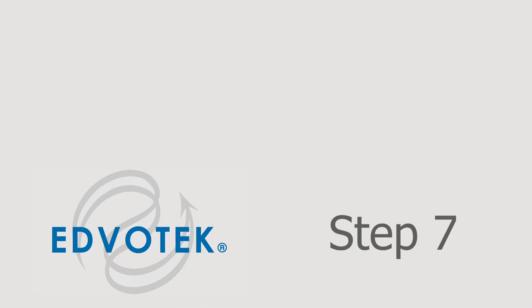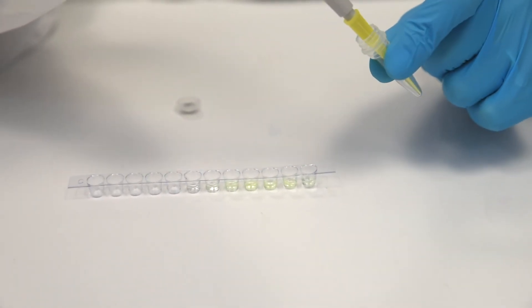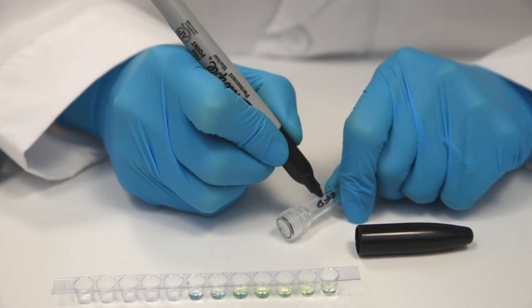Step 7: Transfer 30 microliters of the brightest elution into a screw-top microcentrifuge tube. Label the tube GFP native.